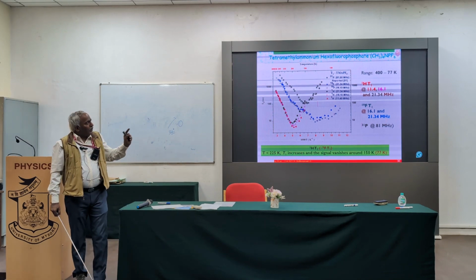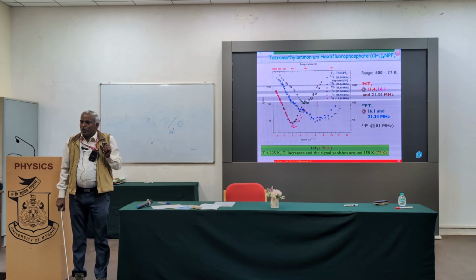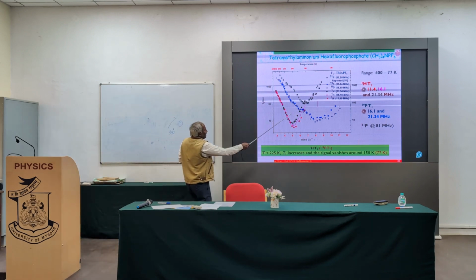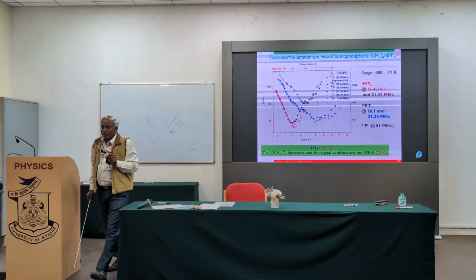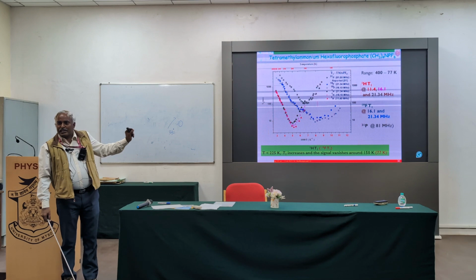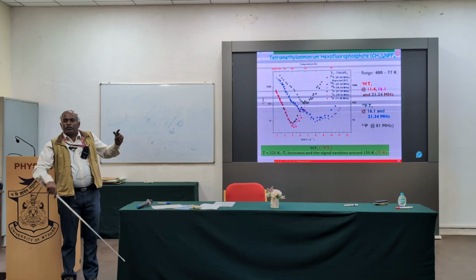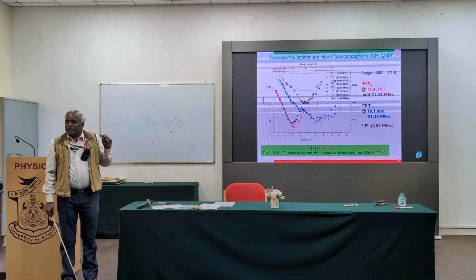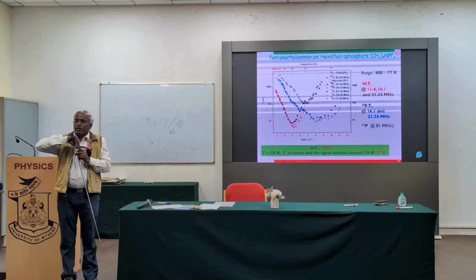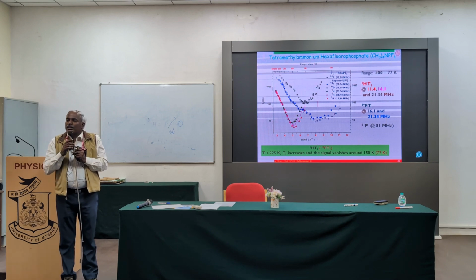Whenever I have to do these things, I have to change my operating system and the magnetic field, and I will get the data. Again, this low temperature region is associated with the quantum rotational tunneling happening in the system. These kinds of fundamental details can be extracted by measuring the NMR data. I don't require a very highly sensitive NMR spectrum to do that. It is just like when the magnetization shows one signal on your CRO, you start correcting the magnitude of the intensity of the signal, and just keep on monitoring it as a function of temperature.